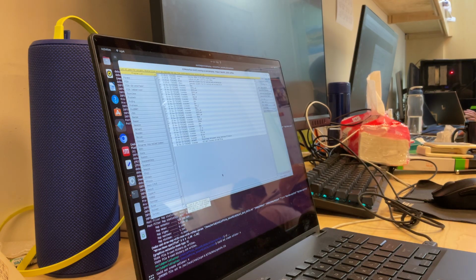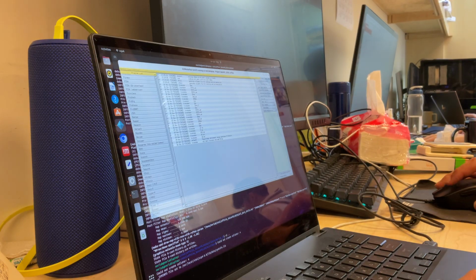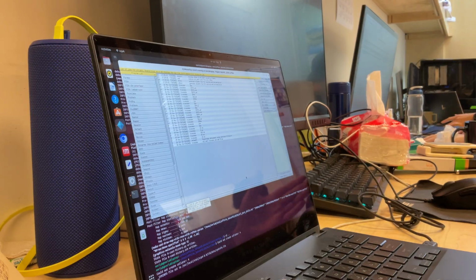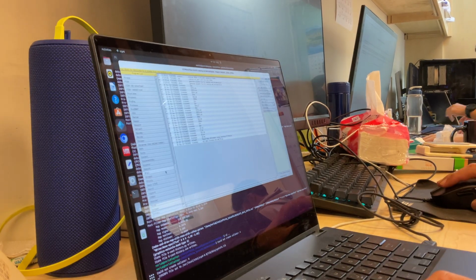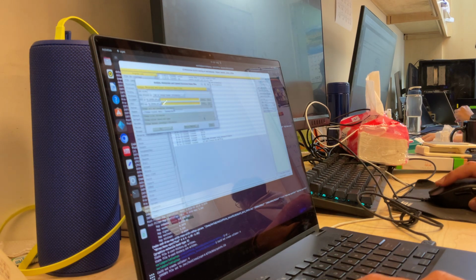Okay. However, for looking at the difference map, this is an annoying limitation of Phenix. Phenix cannot take the same file for both datasets in the difference map. You see? So now we need to use SF Tools to separate them. So now that we have scaled them, we separate them. Okay? So now we go to SF Tools here.